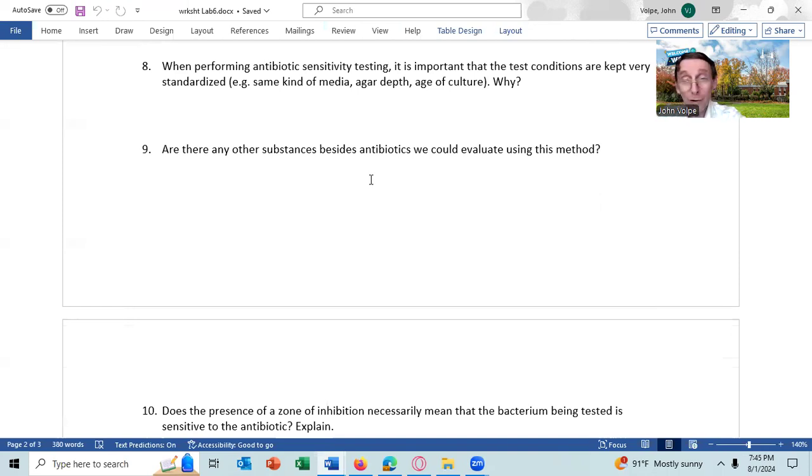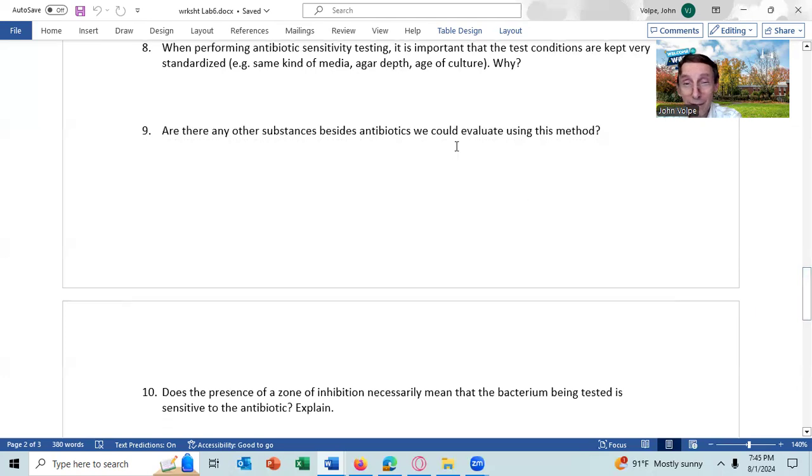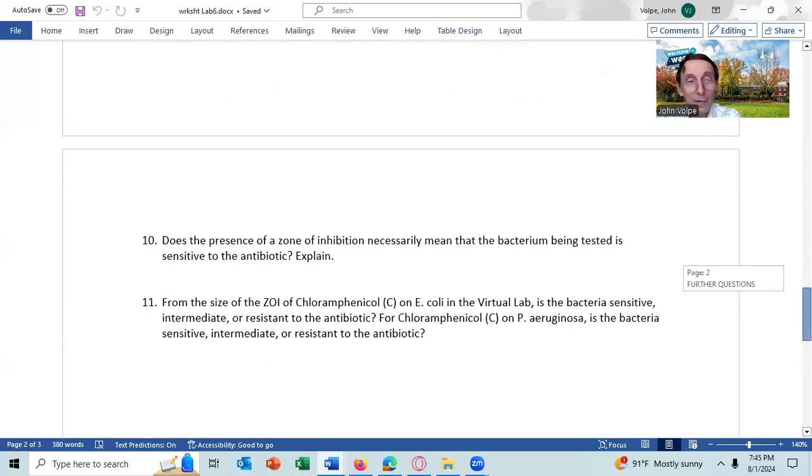If it were, you could say hair tonic, or you could say a specific hair tonic, like, I don't know, Grecian Formula 12. You just need to name one thing. Okay. And I gave you one that, to my knowledge, does not form a zone of inhibition. So it's not one you can use. You have to come up with something.